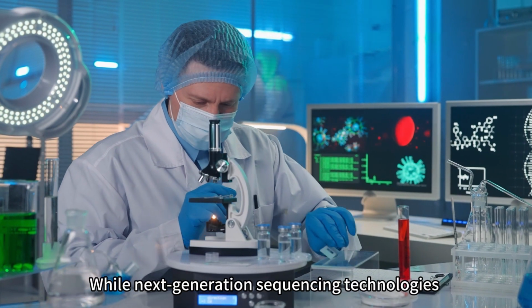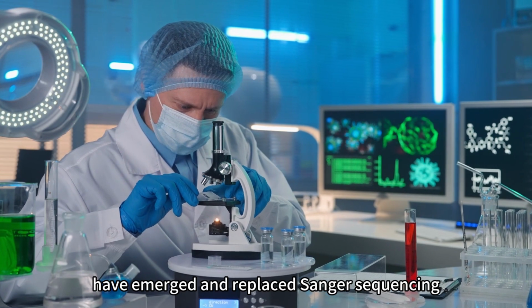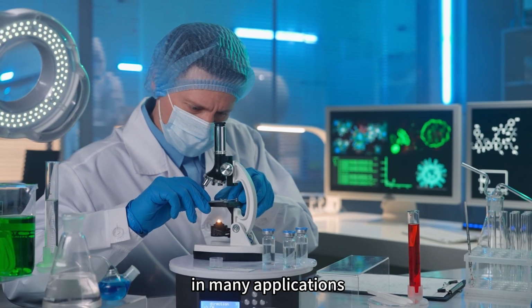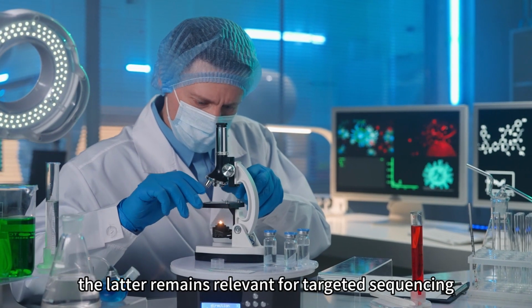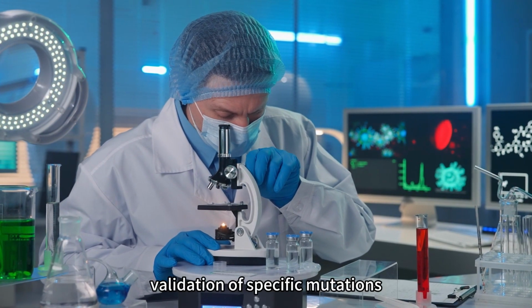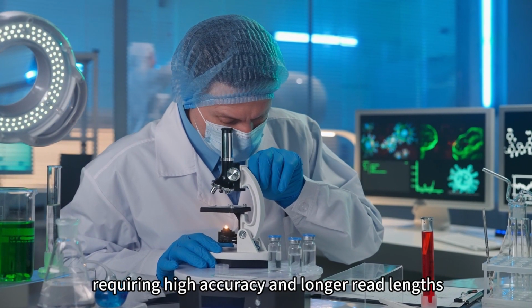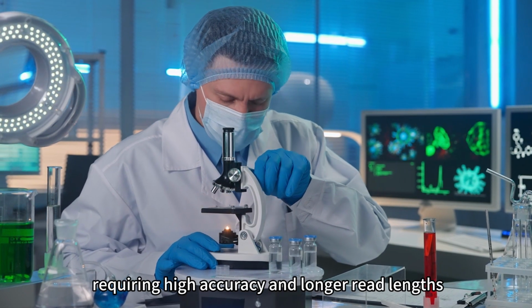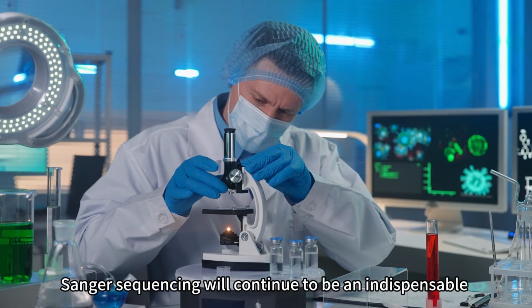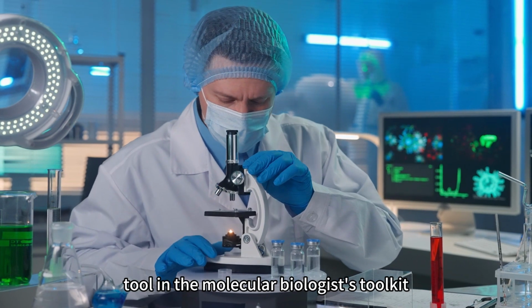While next-generation sequencing technologies have emerged and replaced Sanger sequencing in many applications, the latter remains relevant for targeted sequencing, validation of specific mutations, and other specialized cases requiring high accuracy and longer read lengths. Sanger sequencing will continue to be an indispensable tool in the molecular biologist's toolkit.